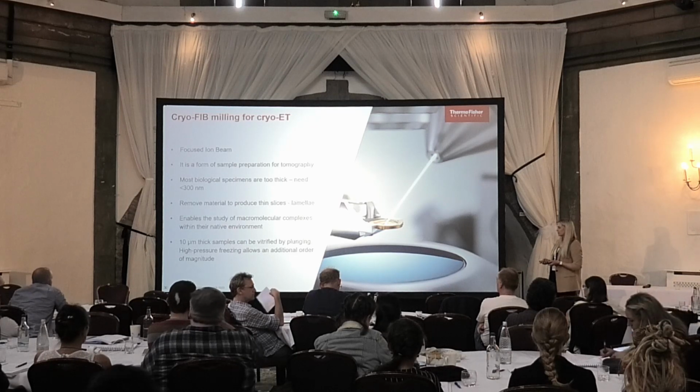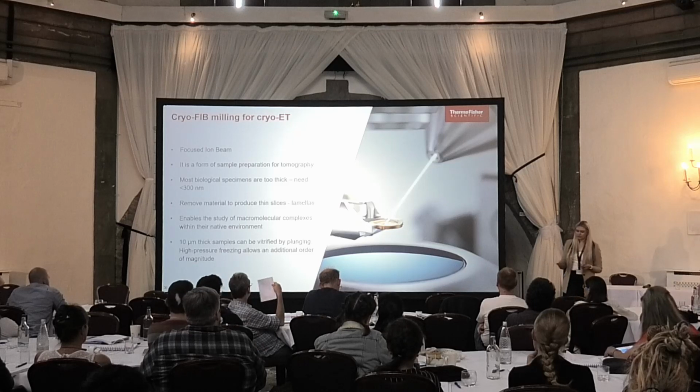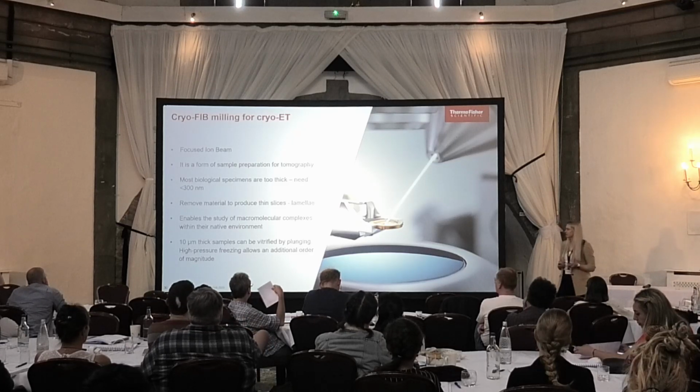And one note about vitrification: if it's up to 10 micrometers, plunge freezing should be possible. Above that, you need high pressure freezing.